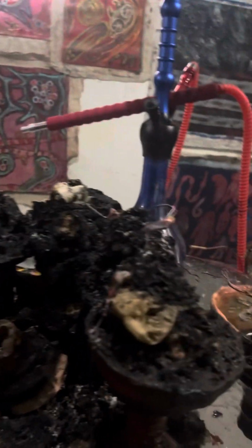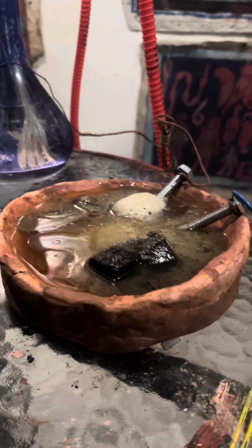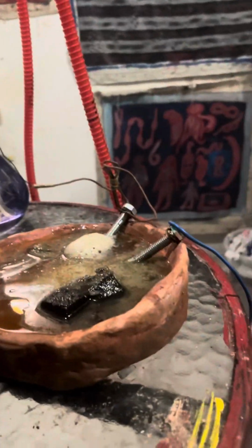Okay, good evening. So this will be a microscopic examination of two slides that were taken from the electrolysis clay chamber before I started the electrolysis, maybe 30 minutes ago. It's like a reference video to see before and after, to see what kind of change the electrolysis actually produced. We can see that actually.